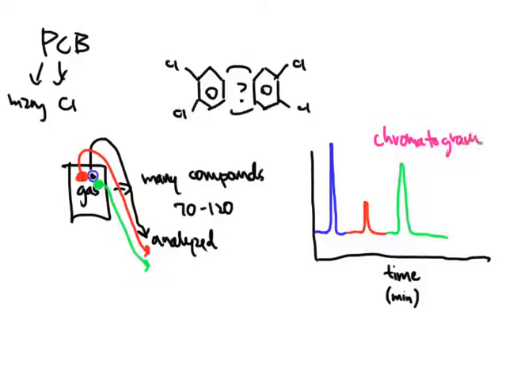And all chromatography instruments make a chromatogram. And GC is no different than any of the others. So when we ask you about a chromatogram, this is the graphical representation of the number of different components that are inside of that mixture. And from this one, we will take away there are three components in the mix that was given to me.